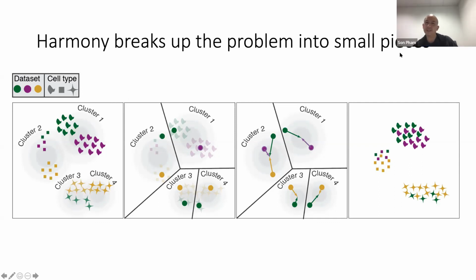What is the main difference between Seurat integrate function and Harmony? So this is something I mentioned before, right? Seurat finds anchors. Seurat essentially can integrate two data sets at a time, and then it adds in a third, adds in a fourth, adds in a fifth to do multiple. Seurat uses anchor base, so it finds cells that it thinks are very similar across two data sets and then anchors them together. We don't use anchors, we use regression and mixture modeling.